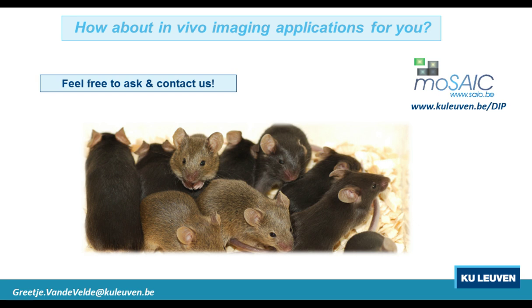Mentioning the faster process, can you give us an idea about how long scans typically take? It depends on the application. So, for instance, if you have a very quick scan just to have total body anatomy, then you can get away with a scan in 8 seconds. But for the higher end CT applications, as the ones I outlined here, it takes a bit longer because you want to scan at a better resolution. So for the Down syndrome mice, I think we're at a 3-minute scan, definitely not longer.